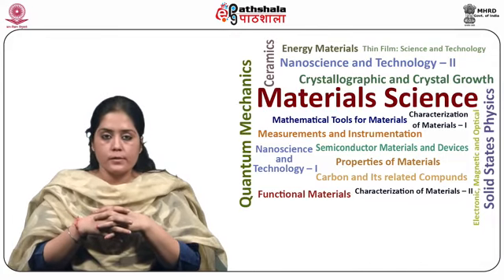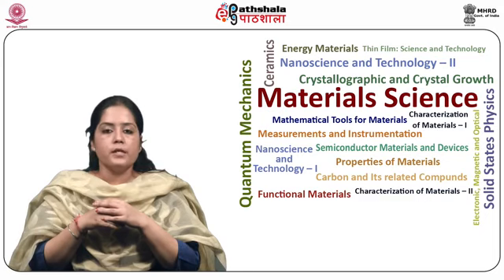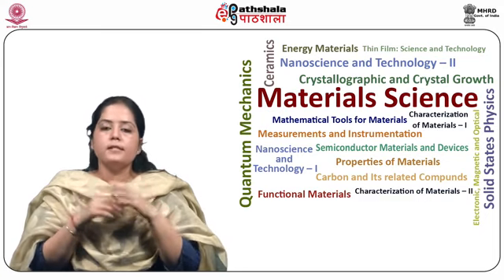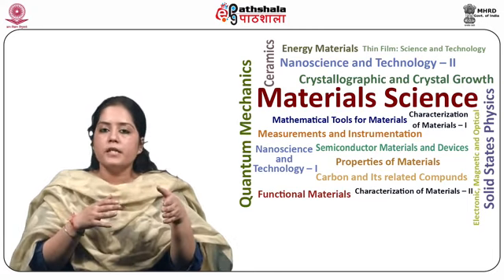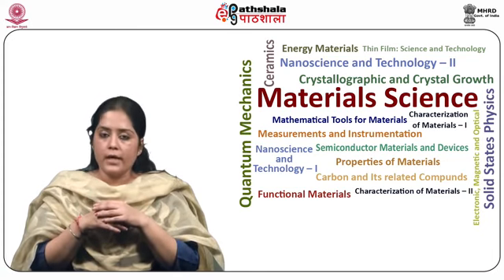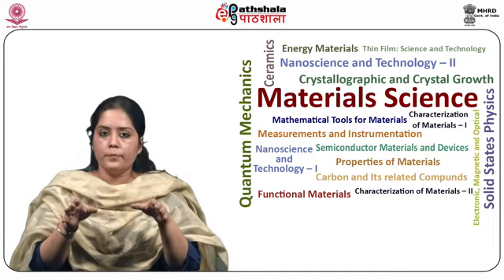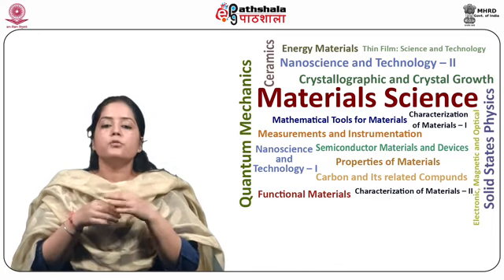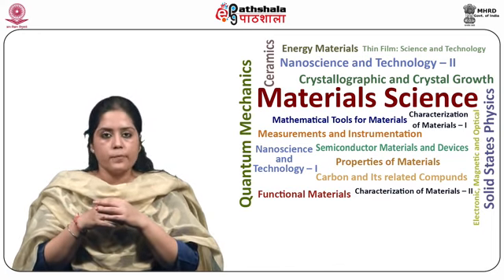Visible light source. Tungsten filament lamp is used as a visible light source. This lamp can produce light in the 350 to 2500 nanometer wavelength range. In a tungsten filament lamp, the energy emitted is proportional to the fourth power of the operating voltage.